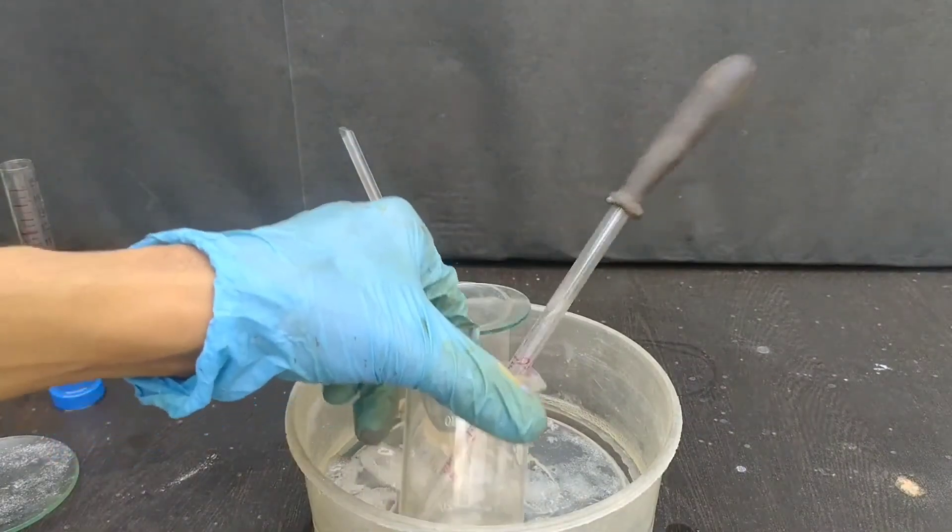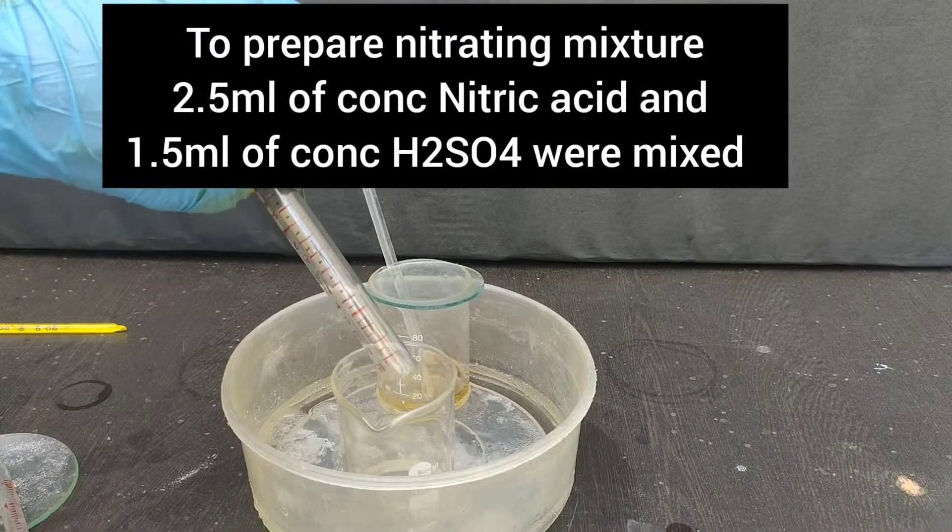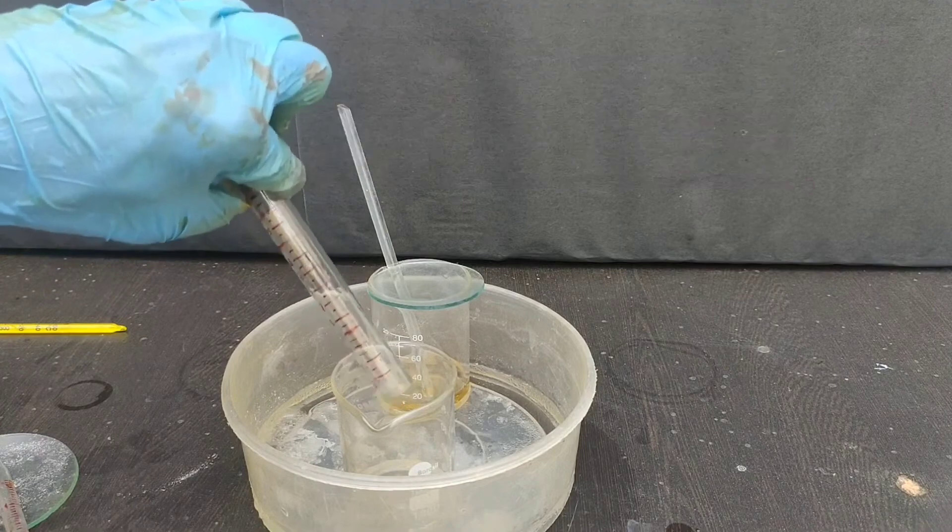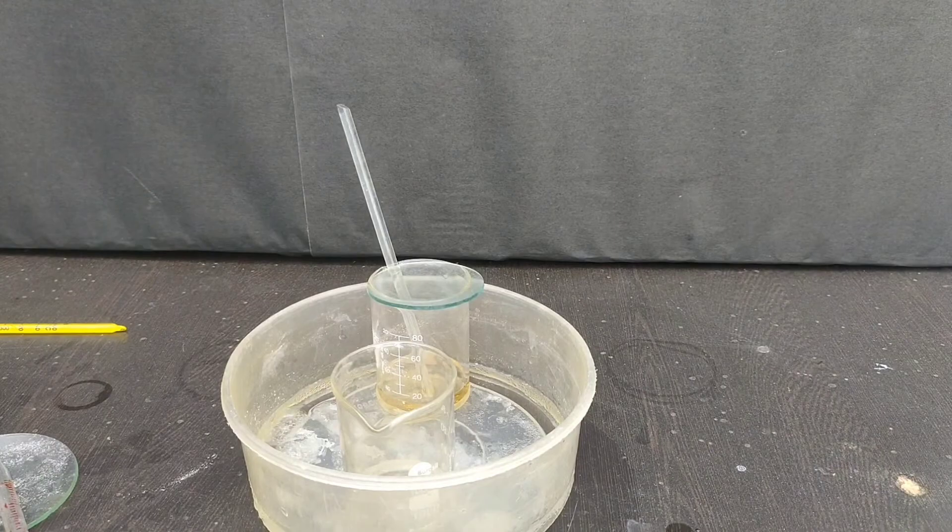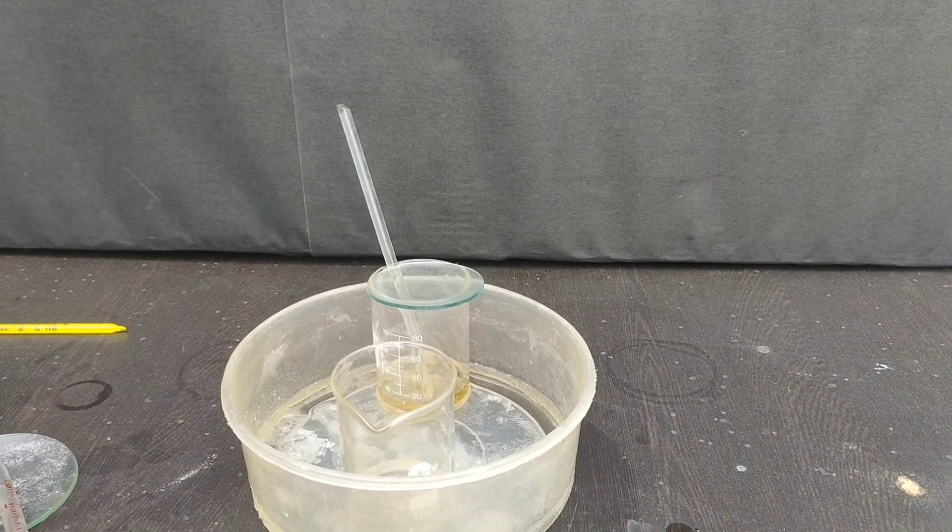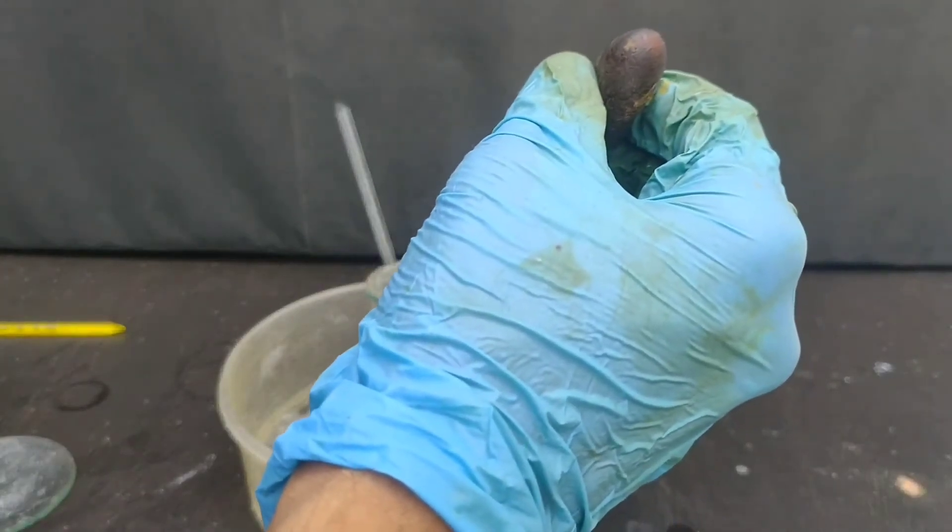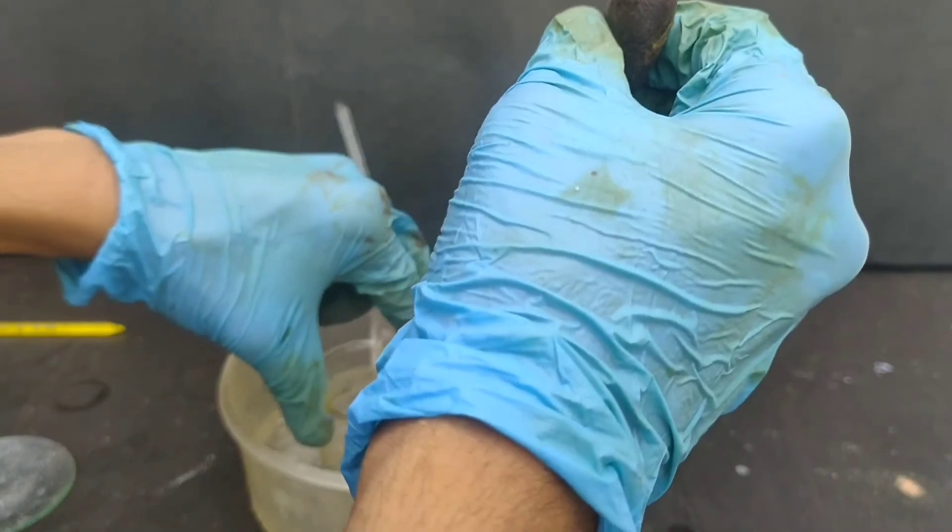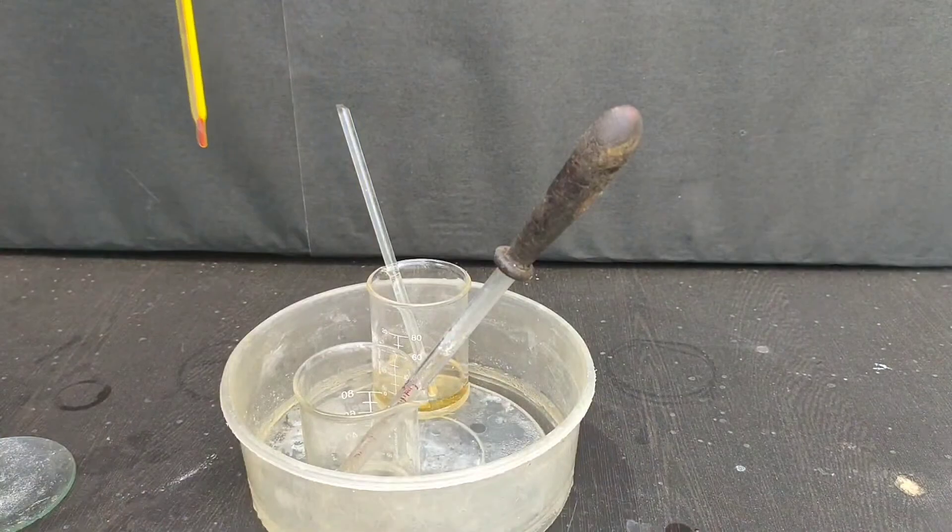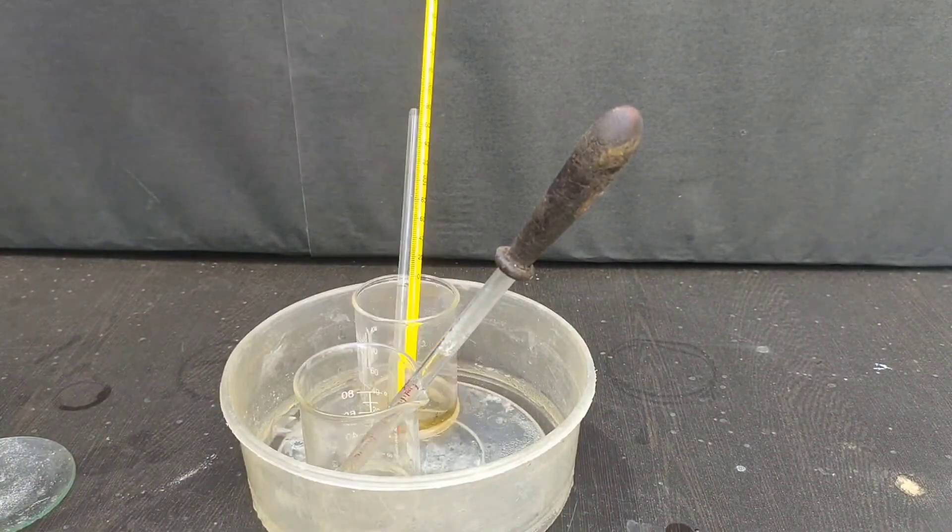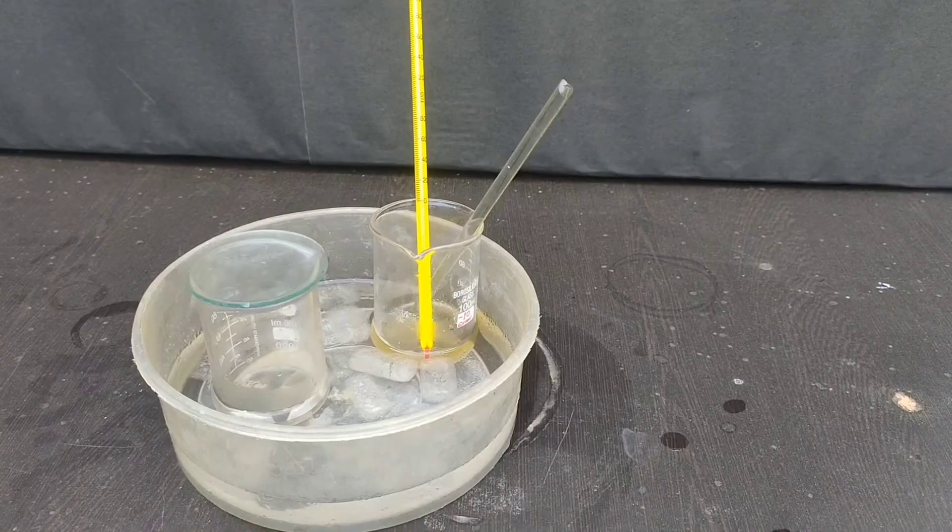First we take the beaker in an ice bath. 2.5 ml of concentrated nitric acid was added in a beaker. To this, 1.5 ml of concentrated sulphuric acid will be added drop-wise. A thermometer was placed inside the beaker to monitor the temperature, and the solution was chilled to 0 degrees Celsius.